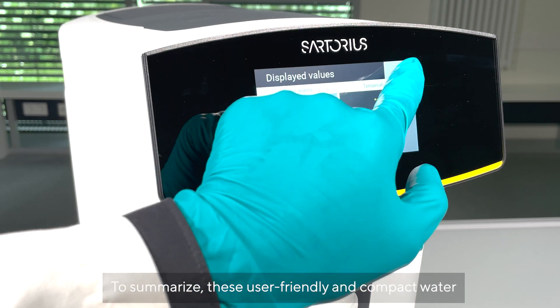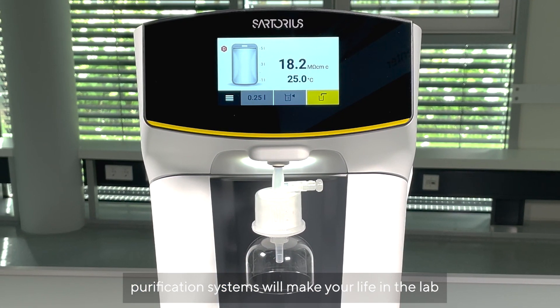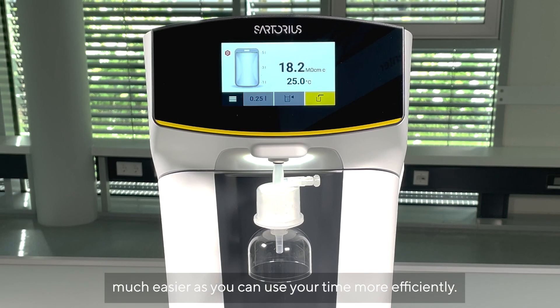To summarise, these user-friendly and compact water purification systems will make your life in the lab much easier, as you can use your time more efficiently.